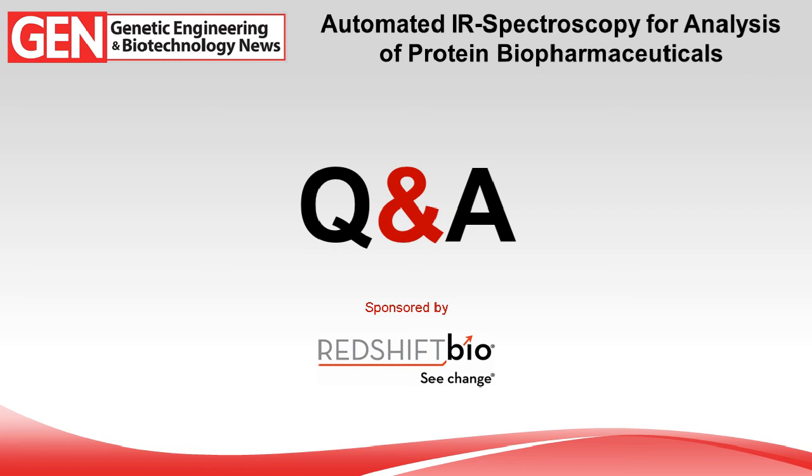All right, thanks for that, Dave. Lucy, we have another question for you. An audience member would like to know, are there any case studies where far UV CD failed, but MMS excels?